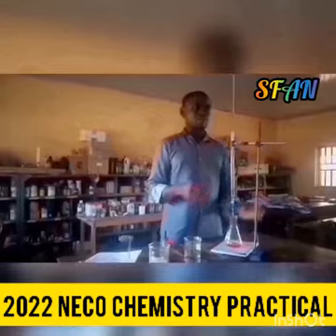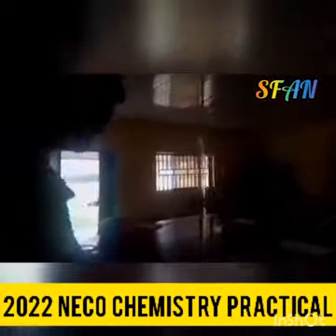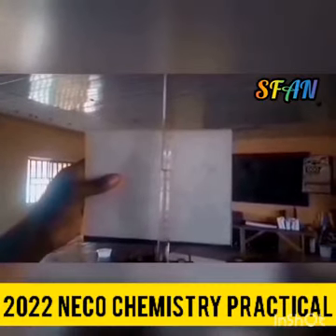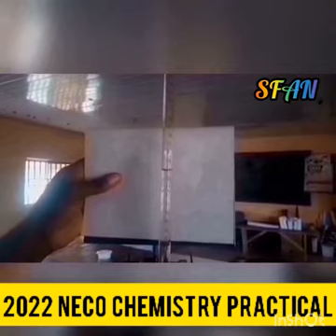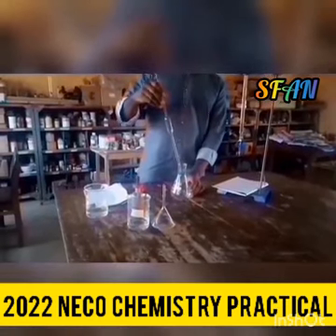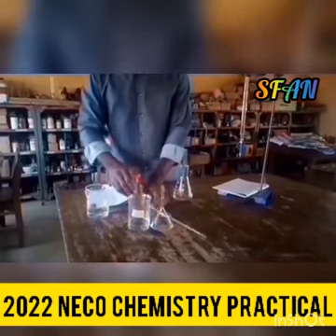Bring the camera close so that we can take the reading on our burette. So you see, our reading is 13.9.